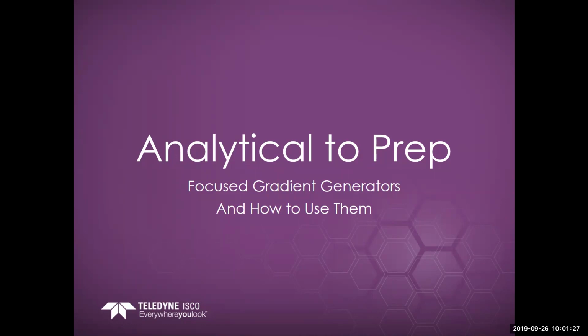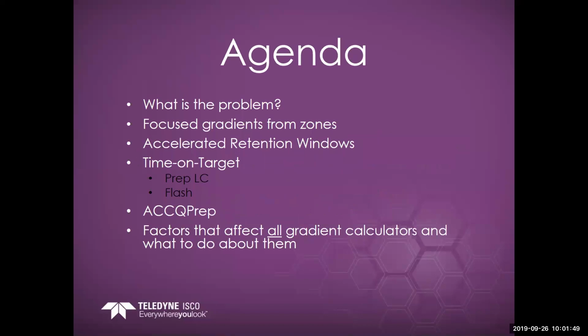Hello, everyone. Good day. I hope all is well with all of you. Tori indicated that we'll be talking about our focused gradient generator, but I'm going to be talking about a variety of focused gradient generators and some of their advantages and disadvantages. So our agenda is: what is the problem?